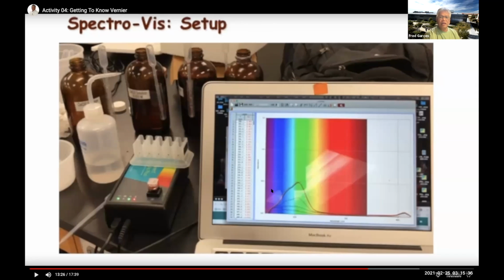You guys are going to be graded for your unknown here, okay? So that's part of, well, again, you guys are watching the video, so you're not really doing a technique, but if you were in lab, this is how you would do it. And it's important that you know this if you haven't been exposed to it already, because you do this in organic chemistry as well. So let's move forward, and I'm going to just scrub forward, okay, on this.